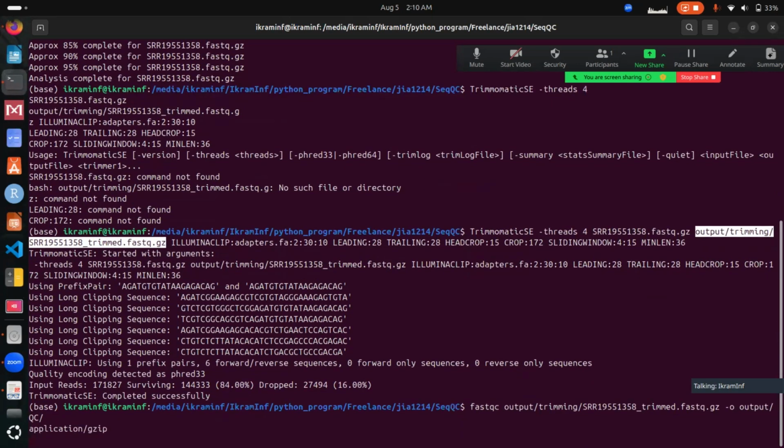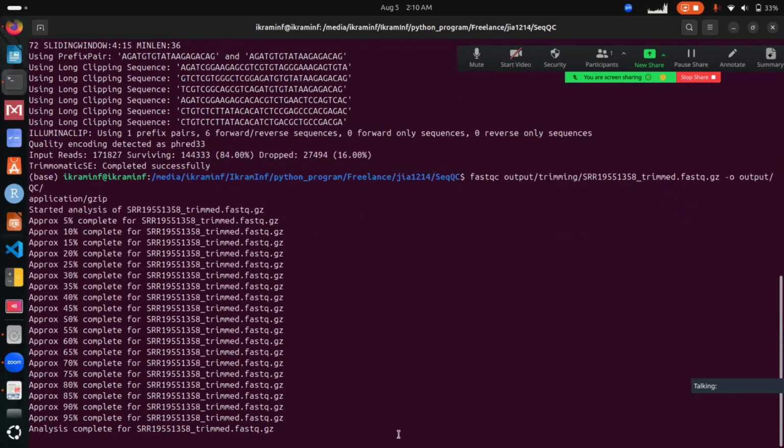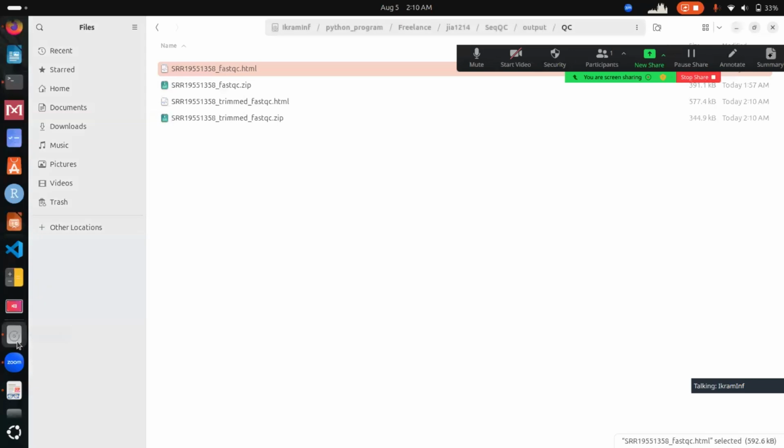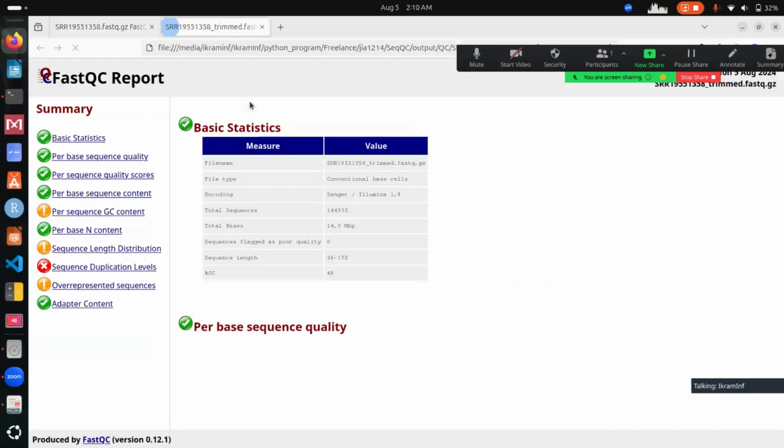If we run it now, okay, it's finished. If we go to our directory, this is the file we have got.